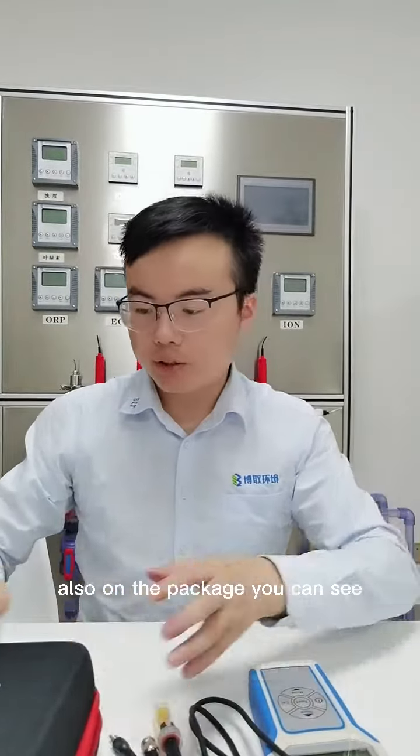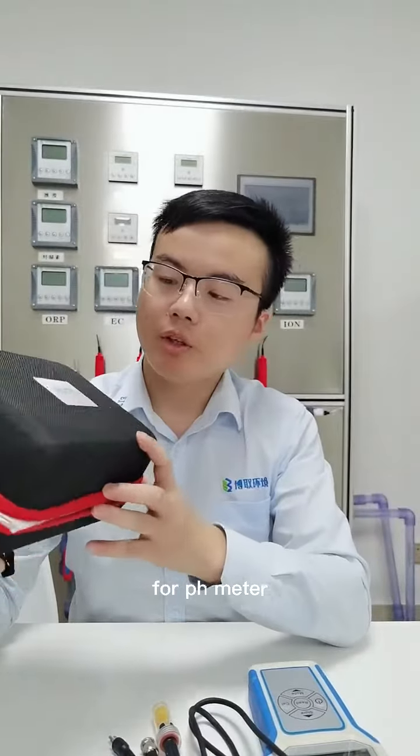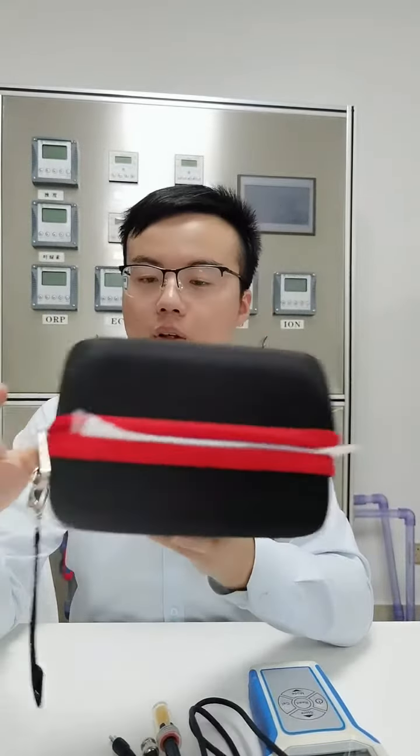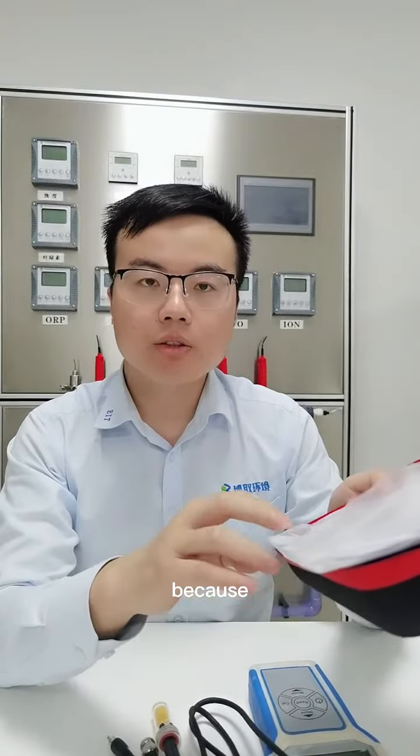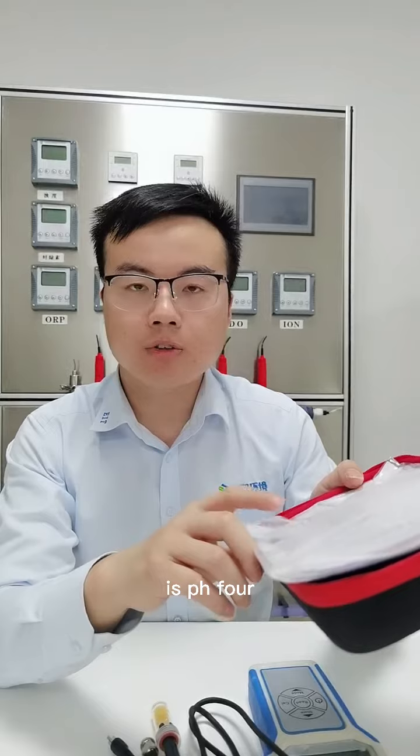Also, for the package, you can see it is very portable. For this portable meter, the pH model is 1701. The first item in the package is the pH buffer, because the international standard is pH 4, 7, and 10.